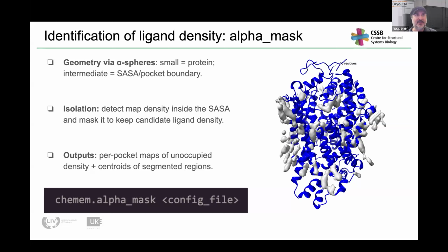And to follow up, is it possible to force the searches to look for multiple conformations? It will kind of do it naturally anyway. With the docking, that's what it does. So how the docking works, I didn't really have time to go into it here. Essentially it'll break it down into a grid of what's possible for where your ligand can be, and start searching all of these different positions initially randomly, and then as it learns more about where this thing likes to go, they should converge into areas that it likes to be more. During this phase, all of these solutions are given back as where it's searching. And during this phase, it's possible for it to move into this alternate conformation.